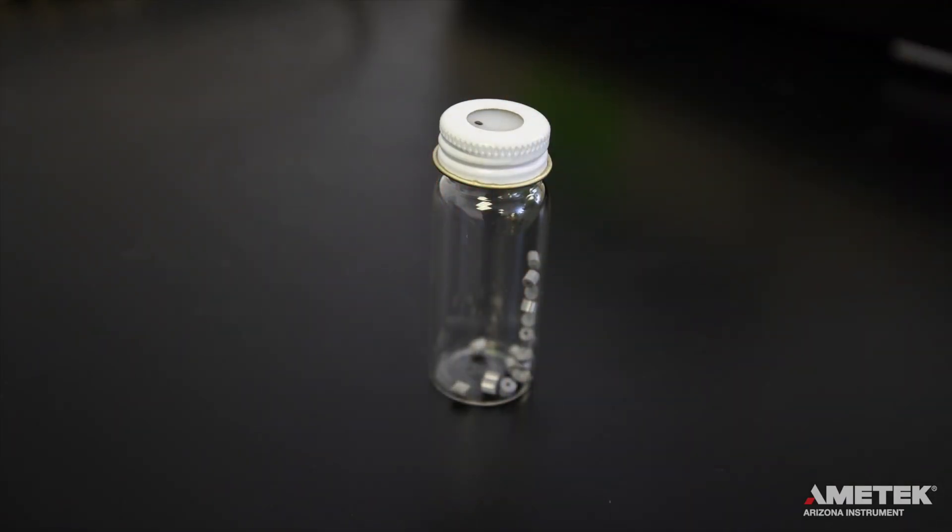Bottles, caps, and even septa can be reused for future tests. Bottles should be cleaned after each test and can be used indefinitely unless damaged in some way. Septa can be reused for up to five tests. Here's a tip: after each time you use a septum, add a dot with a permanent marker to it so that you can track how much you've used it. When it reaches five, throw it away. If you have a liquid sample, wipe the septum clean between tests.